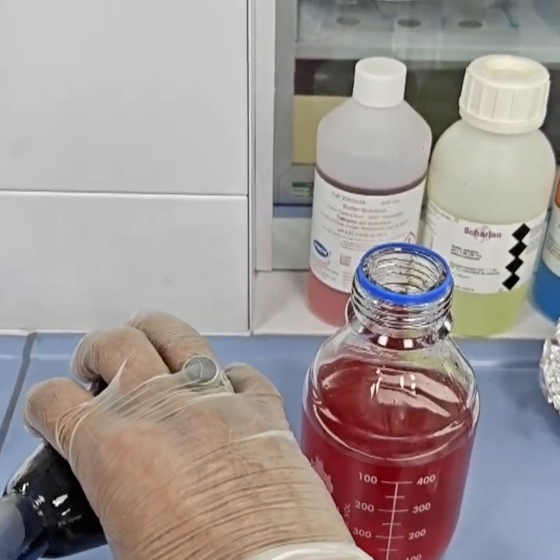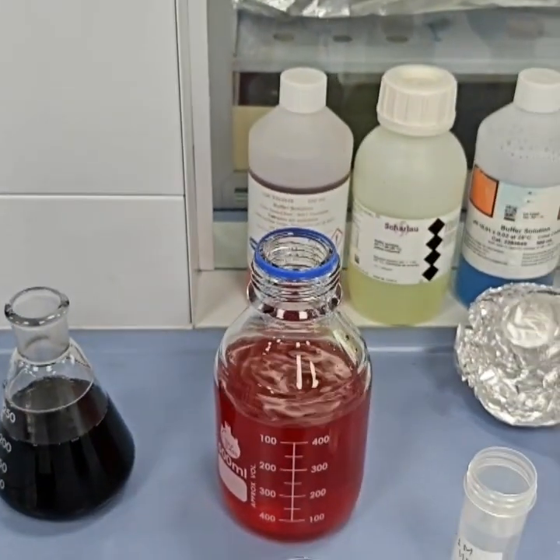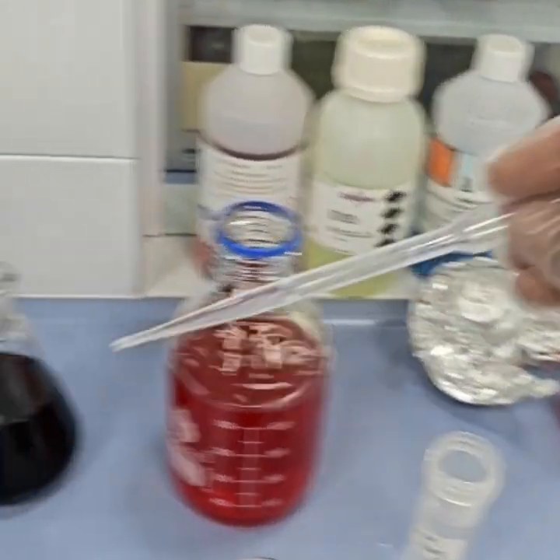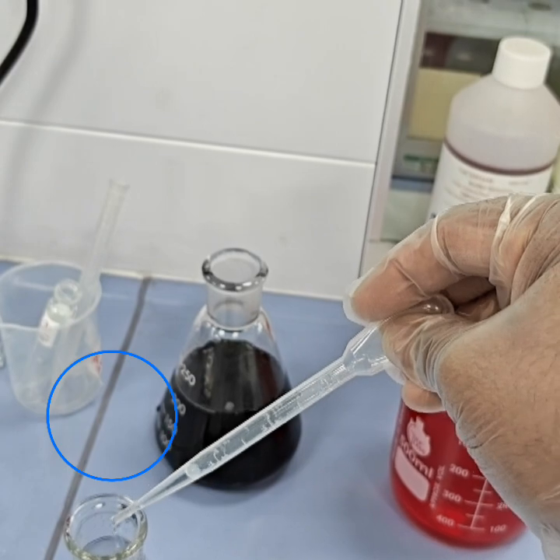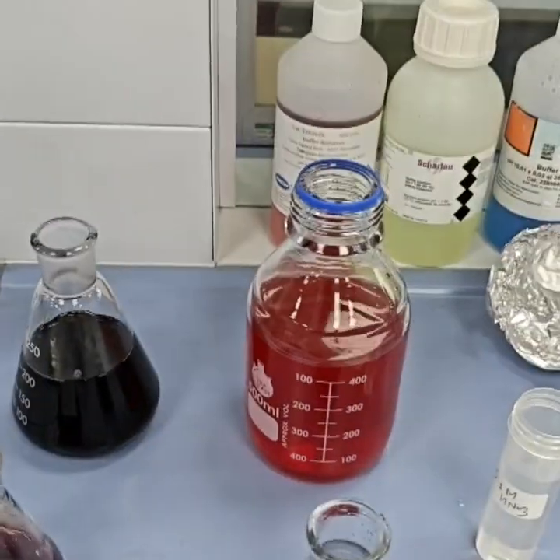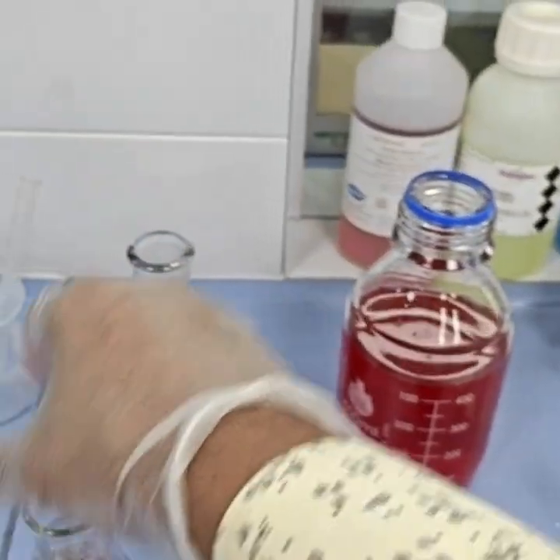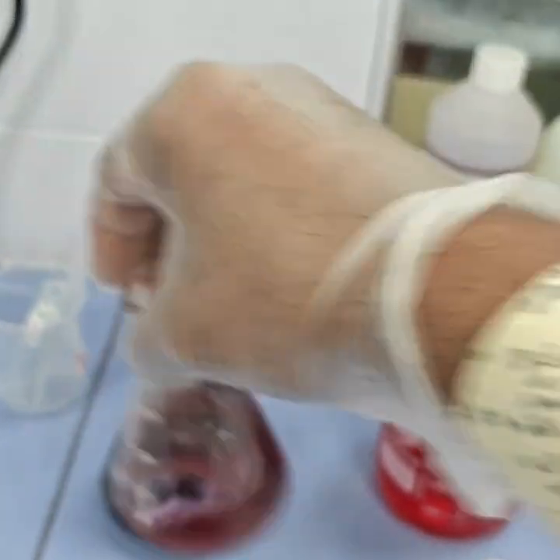Since these solutions are prepared in deionized water, their pH is around 5 or 6. Let us add certain drops of acid to this one. You will see the difference. Here, the color has entirely changed. This pH is around 2, and this is around 2 to 3. The color has entirely changed by the addition of the acid.